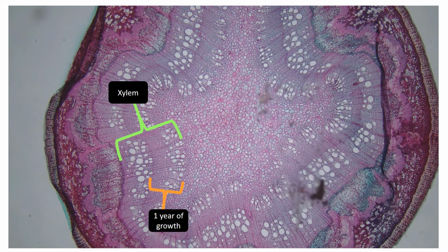And so that there will be the early xylem tissue. And you can clearly see large circles. We'll talk about what those are named in a second. And then it kind of leads into smaller circles. And then there's a second year of growth, a second little row shown, where those big circles come back. And so that's how you can kind of tell the difference between early versus late. Early will have more of those larger circles present, while late will have more of the small circles, which are our good friends, the tracheids. And then when you have all those big circles meet the previous year's small circles, that's generally the clue that you're hitting the next growth year. And so the second year is newer cells, while the first year are older cells.